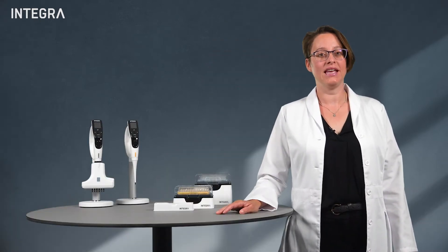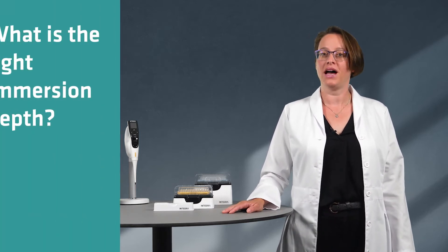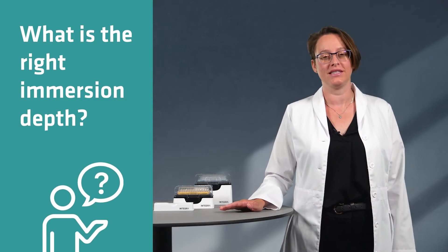Hi there! How you aspirate liquids could be messing with your results. Did you know that? A common mistake made during aspiration comes from the need to place the pipette tip as deep as possible in the source vessel.